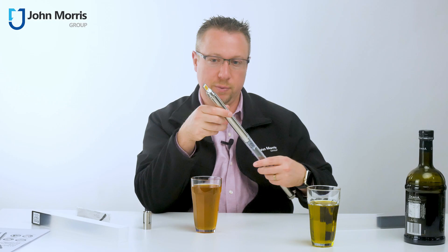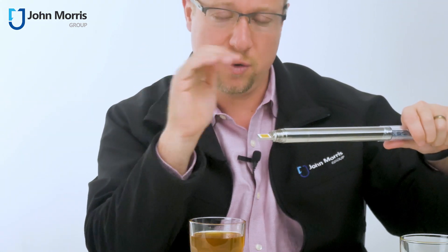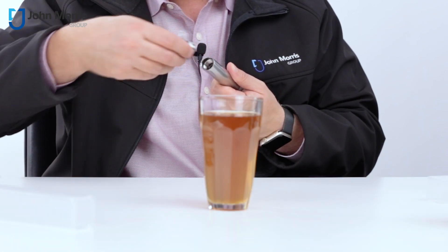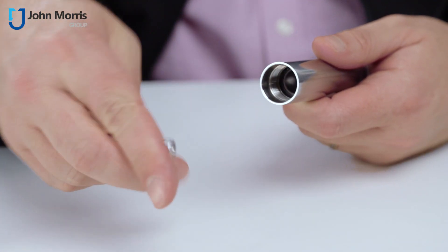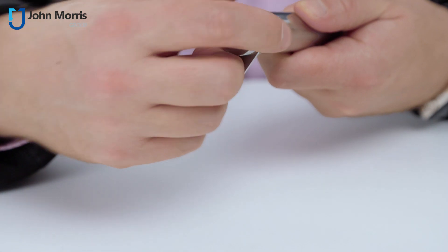To clean this is actually quite simple: hold it under a tap, mild soap, give it a little bit of a gentle wash, and away you go — nothing more to it. To change the batteries on this particular device, simply unscrew the top, place the batteries in — it takes two AAA batteries — and close it back up.